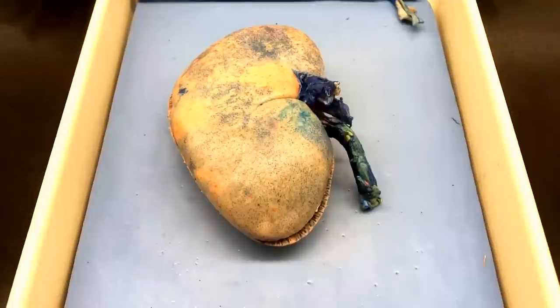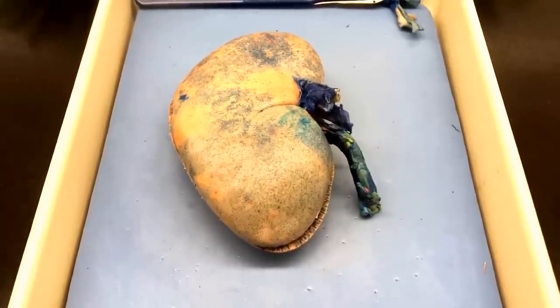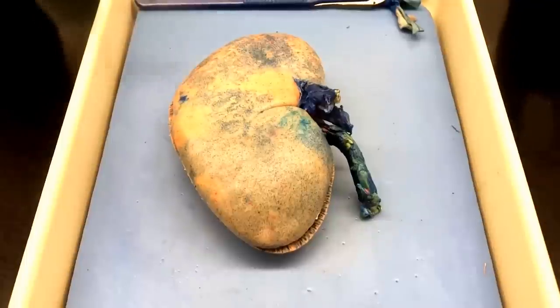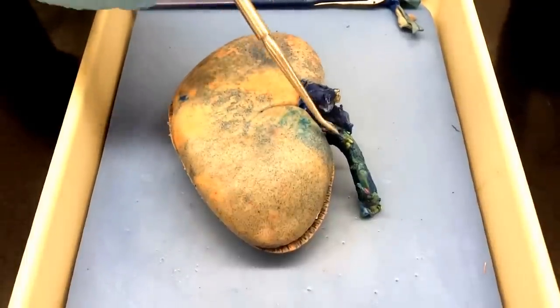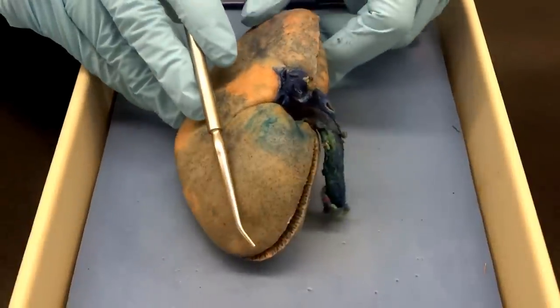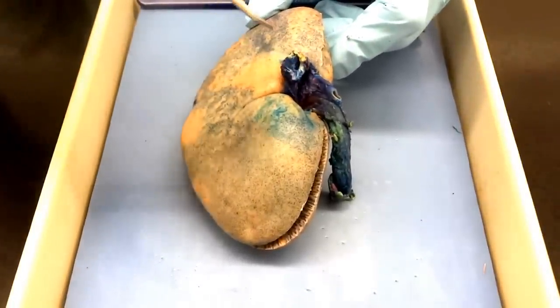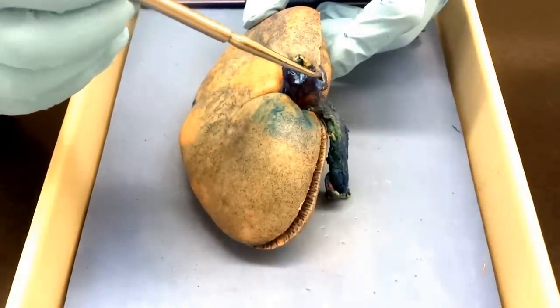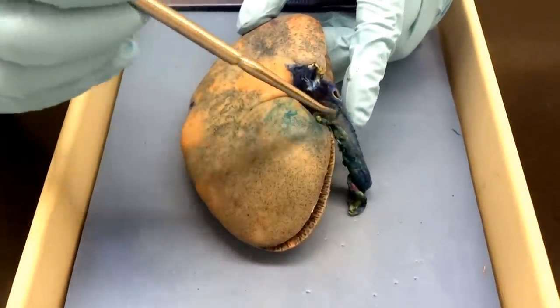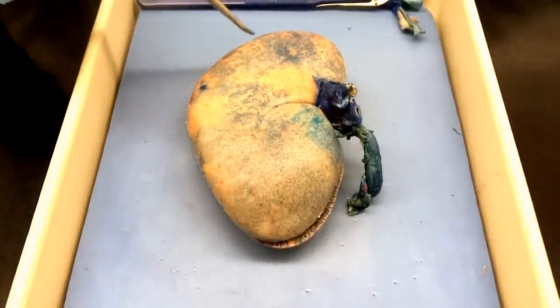So we are going to run through what the dissection is gonna look like that you guys are doing for the kidney, starting with the external part. On here, you can kind of see on the medial border, in the renal hilum right there in the center, we have three things going in or coming out. The renal vein is the thinner-walled vessel, then the renal artery is the thicker one. And then the ureter, which is the part that goes down into the bladder to store the urine. Also on the outside, just the lateral border on the other side.